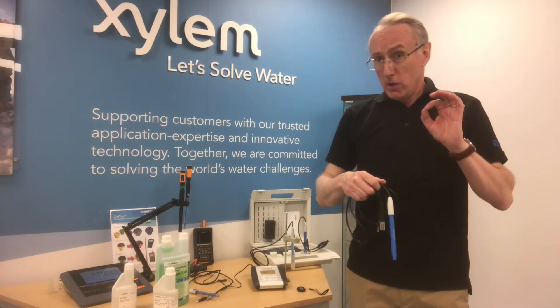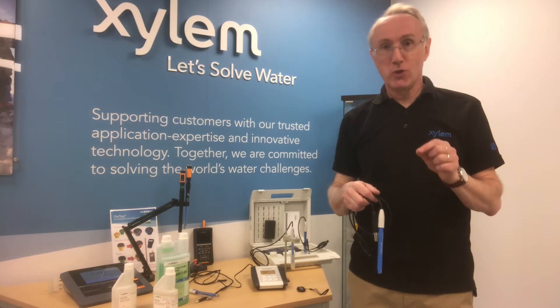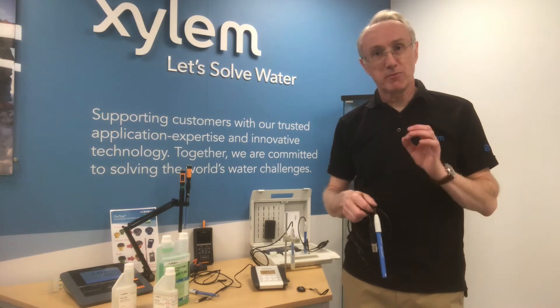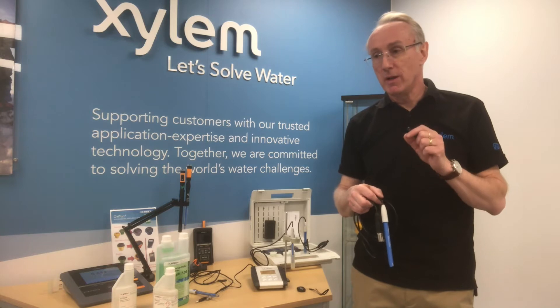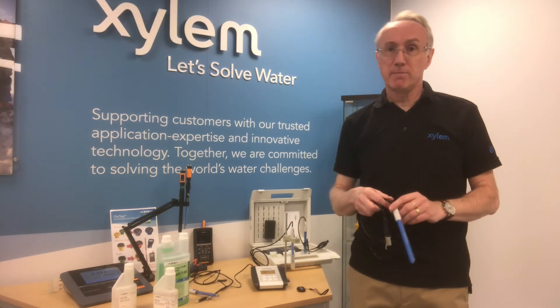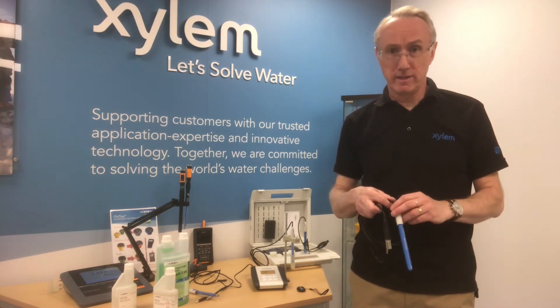My question to you is: do your pH electrodes last as long as you expect them to last, and do they work as well as you would hope? If the answer is no, it's probably one of two things — either your pH electrode is not the right one for the solution you're putting it in, or you need to store and look after it in a different way.